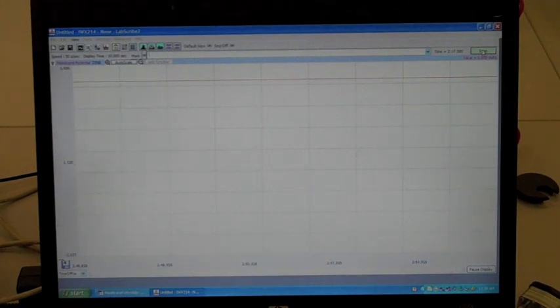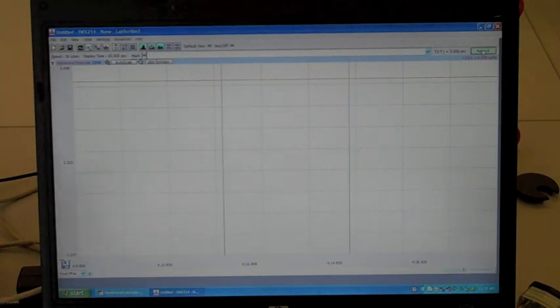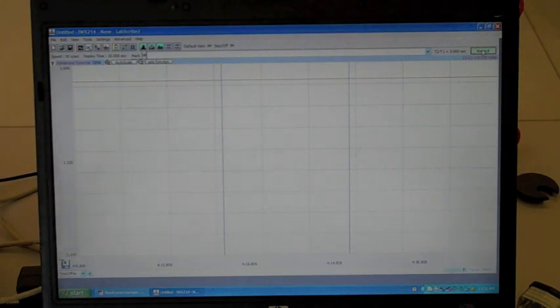So once you've finished collecting all the data that you're going to collect today for all the cells, you are going to go back and use those times that you recorded to identify the important events on your graph.